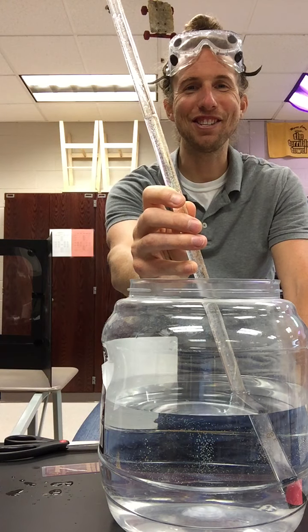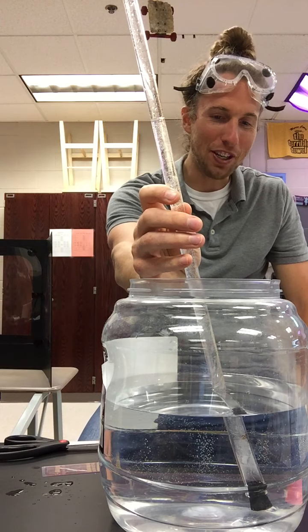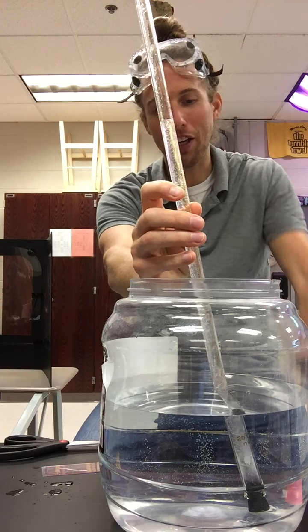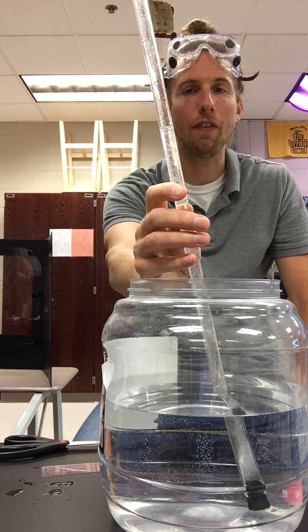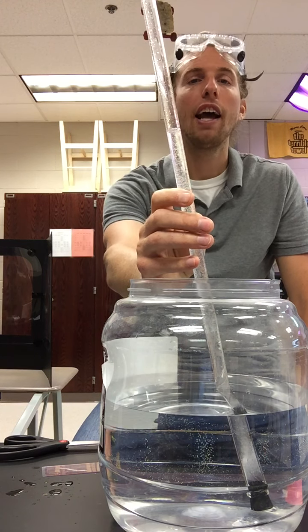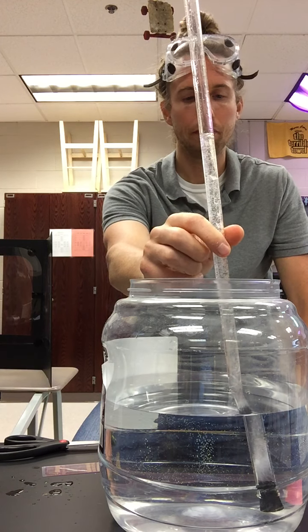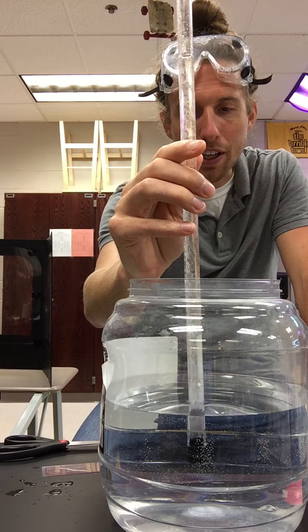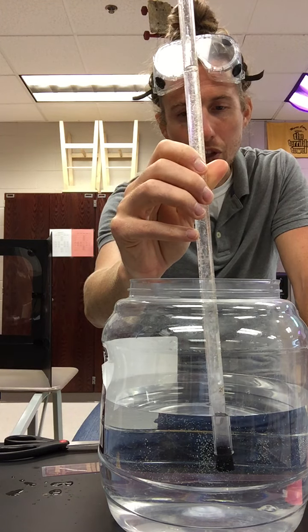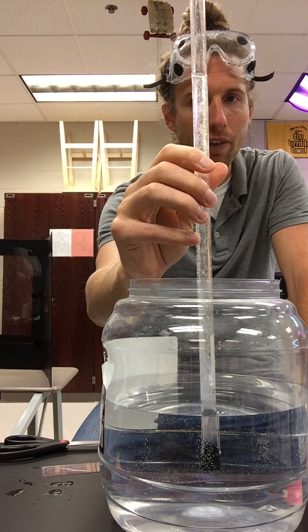I apologize that you just have to sit there and watch this thing bubble, but relatively soon, once it finishes off, we'll be able to get you the volume of hydrogen gas that was released as this magnesium was reacted with hydrochloric acid. It may be hard to see on video, but the magnesium is certainly being consumed by the hydrochloric acid. You can certainly see all of the bubbles rising.